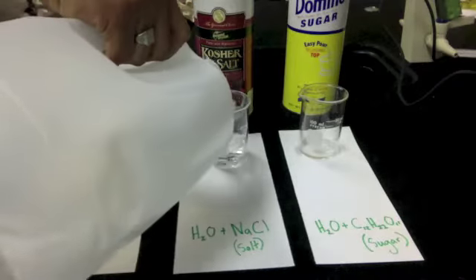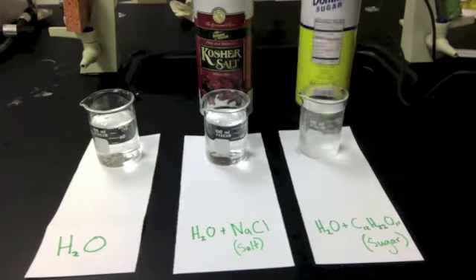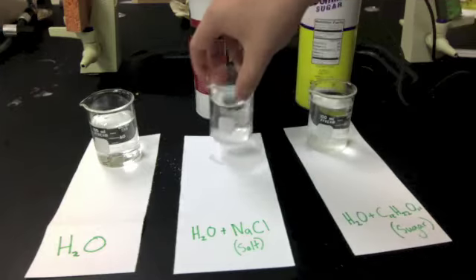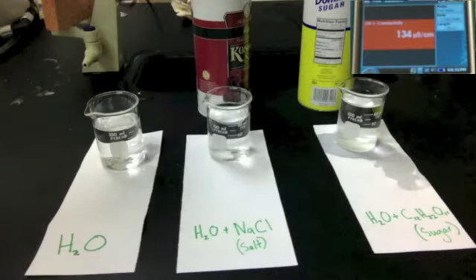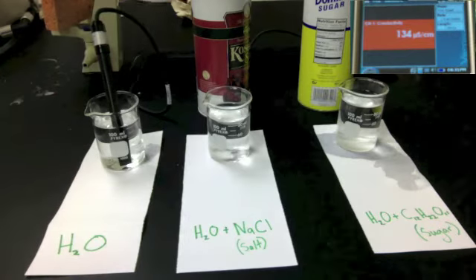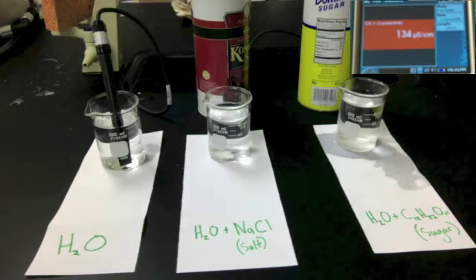Alright, so in this demonstration, we measure the conductivity of three different solutions. We have deionized water on the left, salt water in the middle, and sugar water on the right. First, we measure the conductivity of the deionized water on the left. This served as the baseline for this demonstration, and as you can see, it's 134 microsiemens per centimeter.